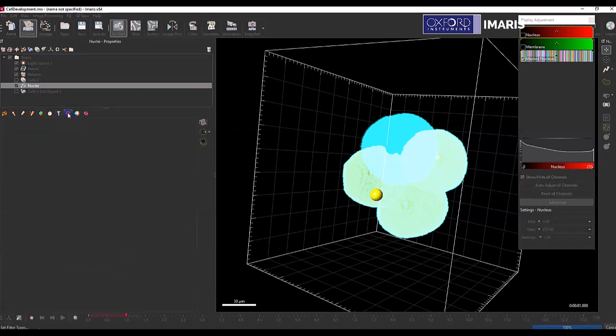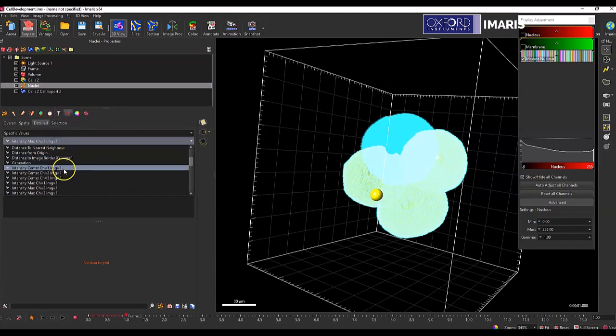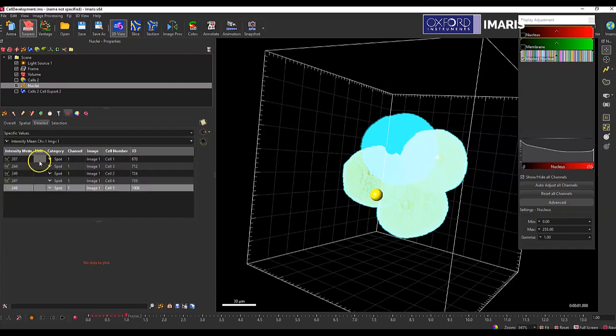And then once this is completed enough, you can then go back to the Statistics tab and look at the different statistics of interest, like if I wanted to look at the intensity of a different channel, not using that third channel that we used to create a label, you'll see that the label that we created using the filter and the label options is now present, and the class that's listed here is going to be the cell number, and then the different titles we use for that classification will be present, and then you can export those statistics out too.